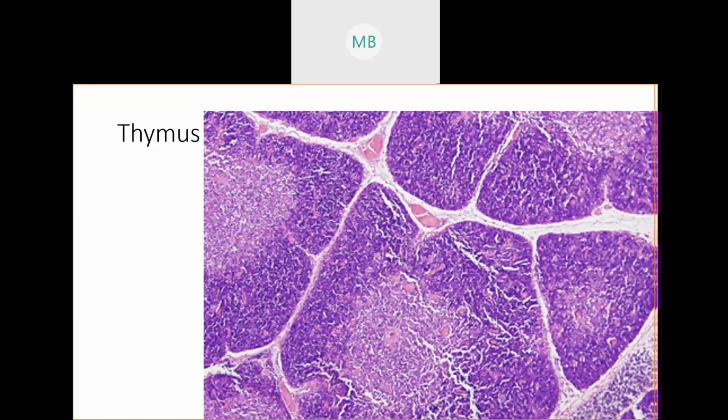Those questions on y'all's lab quizzes and your final exams and midterms are going to be the gimme questions that you're kind of expected to just get right for free points, if that makes sense. So cortex is the outer meaty bit of all of these lobules. Cortex. Medulla is the inner lighter area.